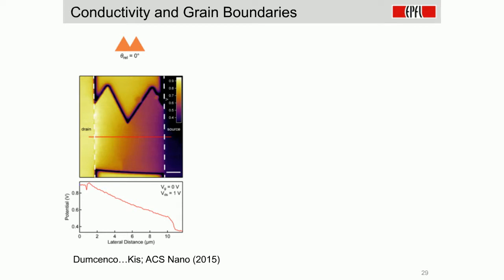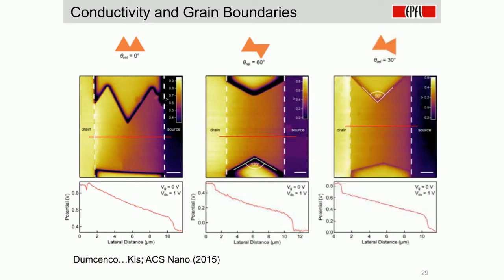And interestingly, we got the same thing in two other cases that we see in our film. This is the 60-degree misorientation in the middle, where you have the two lattices in opposite orientations, and the single crystals are joining together. In this case, you're supposed to get a mirror twin grain boundary, which looks as if you took the lattice, removed one line of either sulfur or molybdenum atoms, and then joined them together.